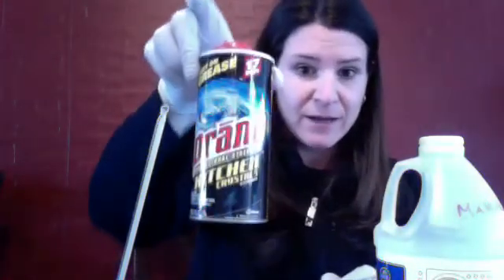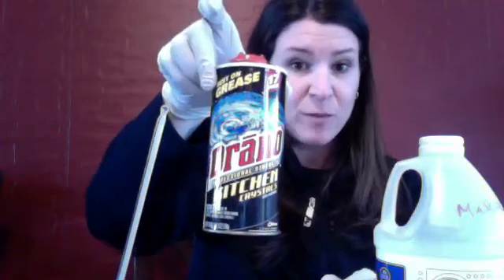The second thing we're using is lye, which we're gonna use in the form of Drano. This is pretty caustic stuff, that's why I'm wearing gloves. I'm sure I'm also supposed to be wearing goggles or eyeglasses but alas I'm not.